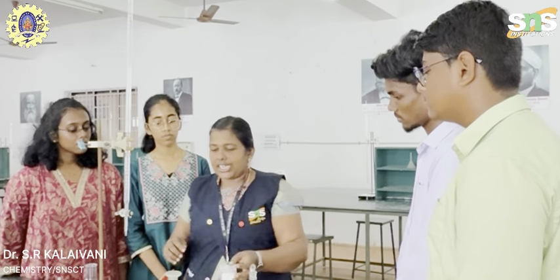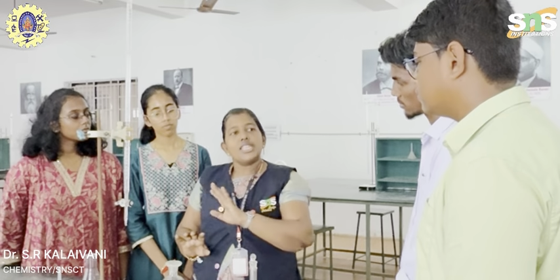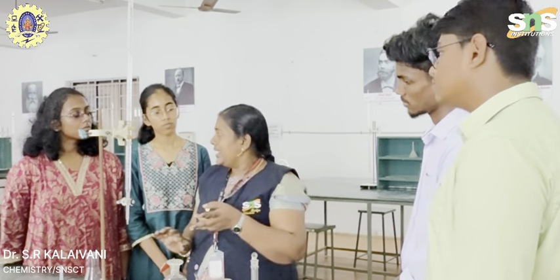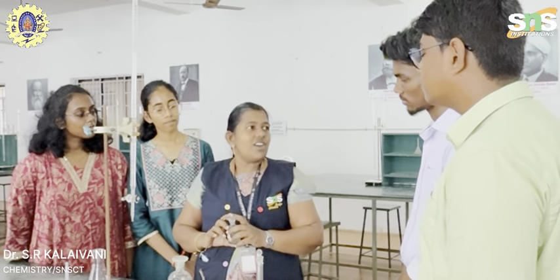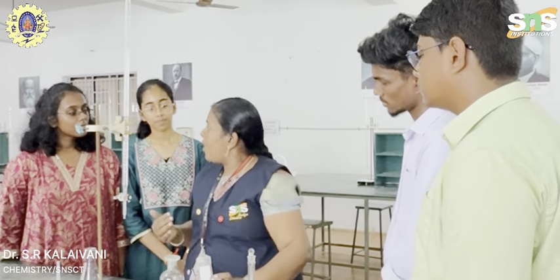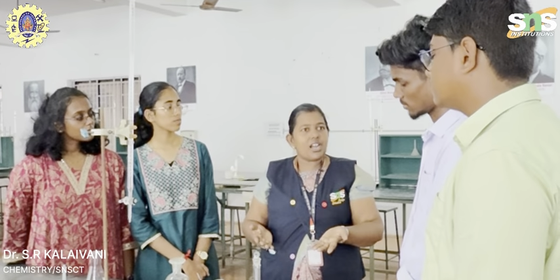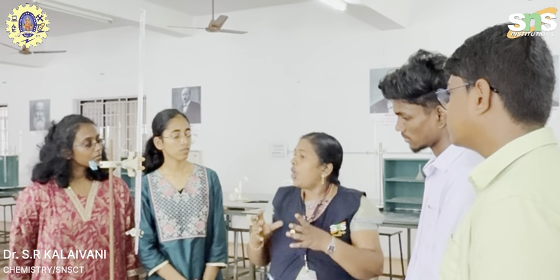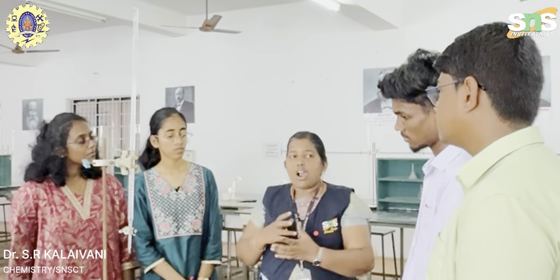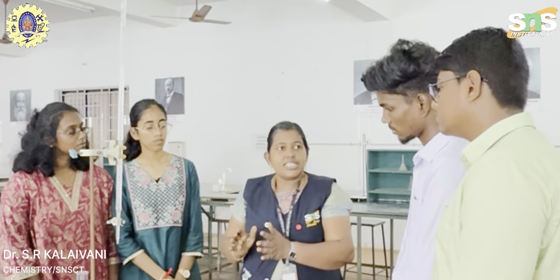Then the third titration, same procedure. The burette solution is always the same for all 3 titrations, EDTA. In the third titration, the pipette solution is a boiled water sample. What is the purpose of boiling? Due to the boiling process, all the temporary hardness is removed. A 100 ml water sample is boiled for half an hour. All the temporary hardness is removed. Only permanent hardness is available.